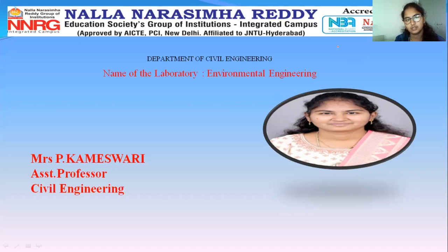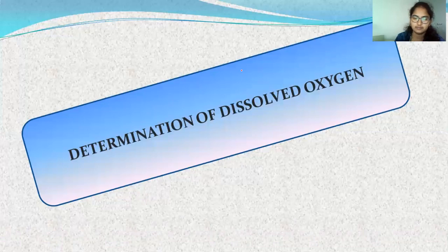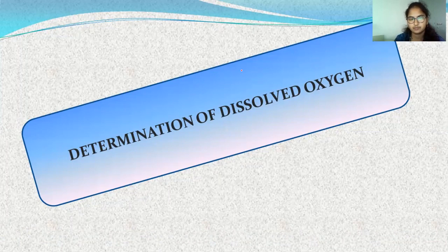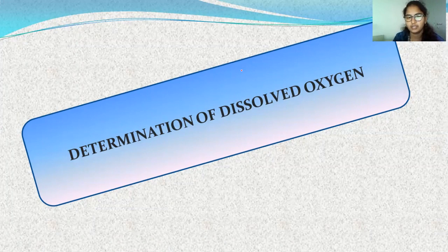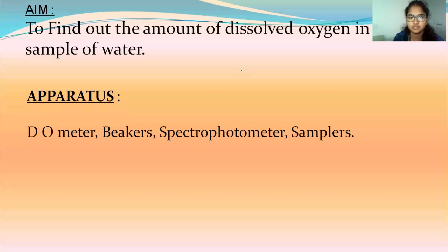Today, we are going to discuss the Environmental Engineering Laboratory. In that, the experiment is dissolved oxygen. What is dissolved oxygen? Any idea? What are the apparatus required for determination of dissolved oxygen?